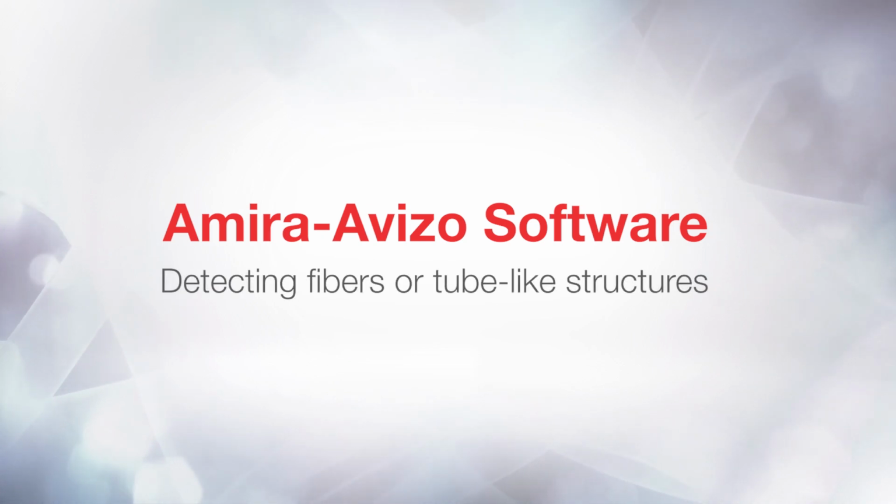Hi, this is Tomas from the 3D Applications team. In this tutorial, you will learn how to extract and analyze fibers in your dataset.